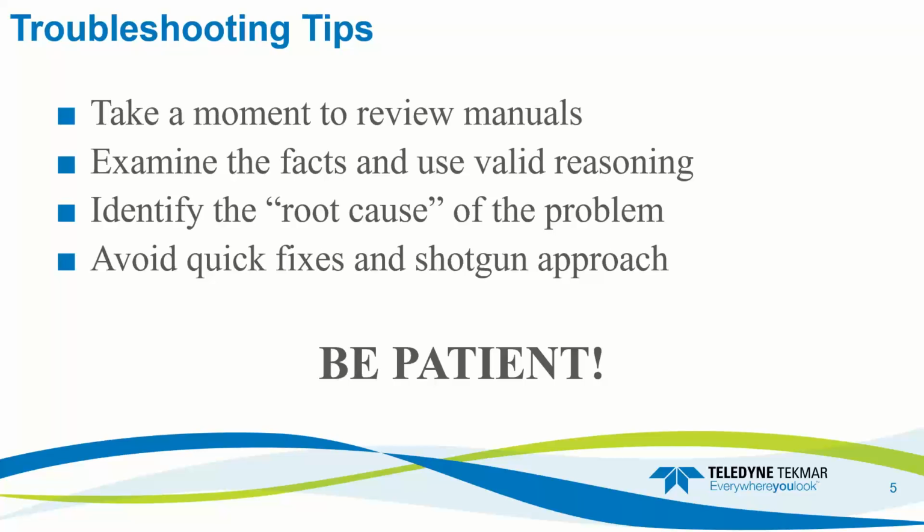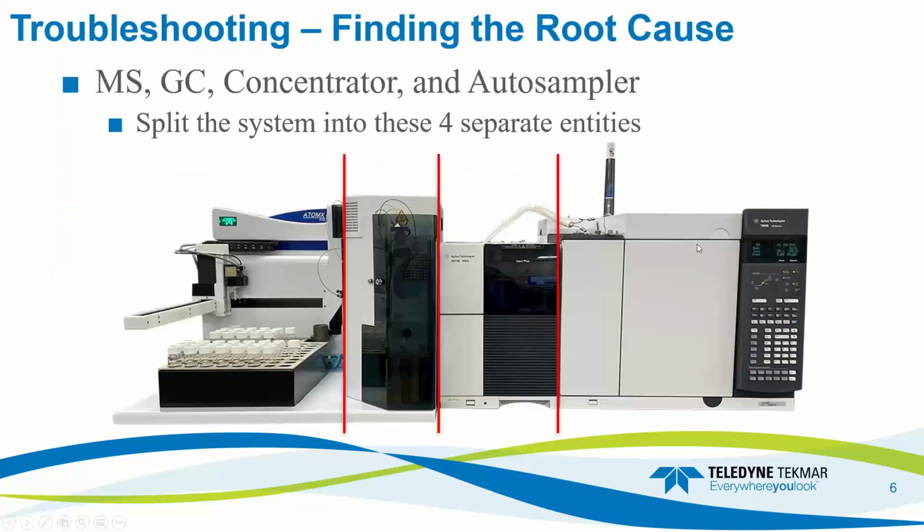Of course, quick fixes might burn you in the long run. You don't just want to fix everything all in one go because that could get really expensive. Try to do one thing at a time so you can really narrow down where the issue is. And in the long run, that'll save you a lot of time and money. So just be patient with this troubleshooting and try and fix it right the first time. You want to identify the root cause.